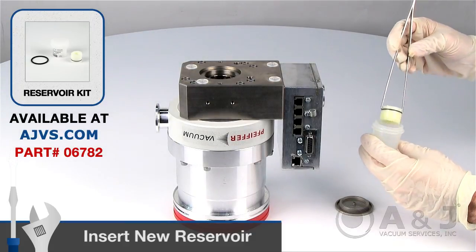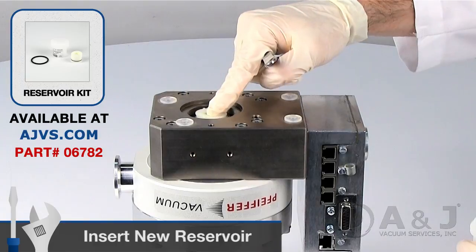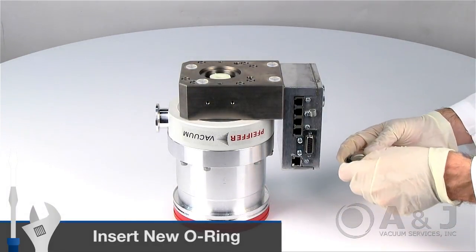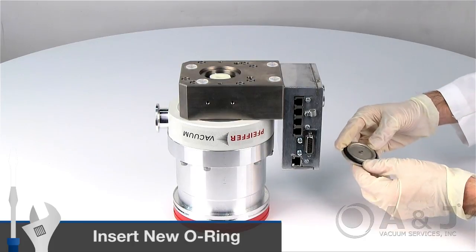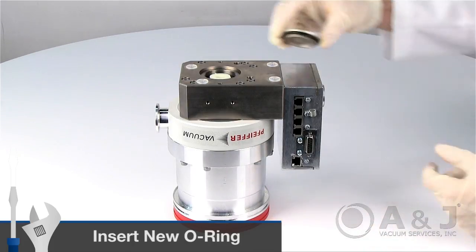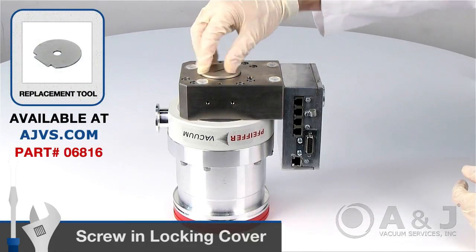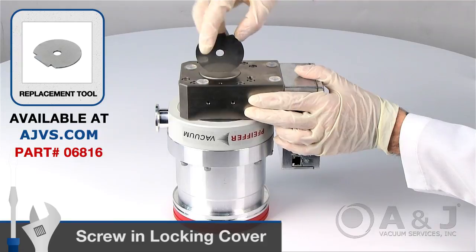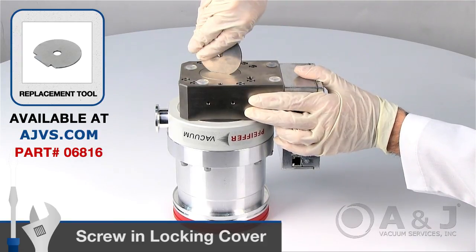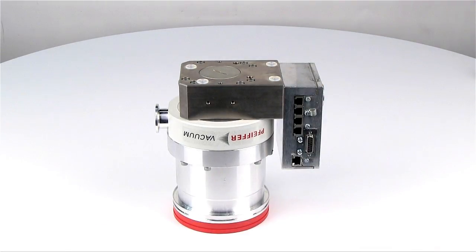Insert the new operating fluid reservoir into the turbopump by pushing it up to the O-ring. Install the new O-ring from the reservoir kit by pushing it into the grooves of the end cover. Finally, screw in the locking cover and tighten with the Pfeiffer Reservoir Replacement Tool. The operating fluid reservoir is automatically brought into the correct axial position. The reservoir replacement procedure is complete.